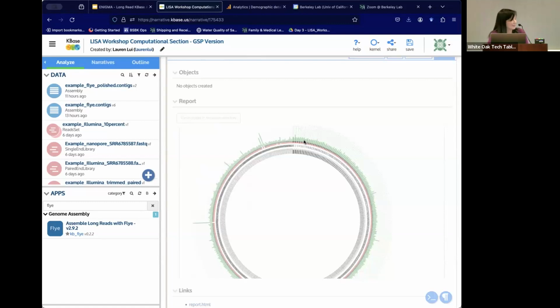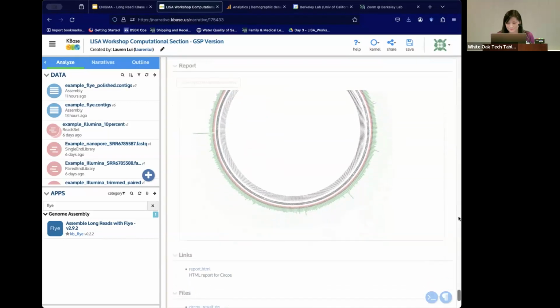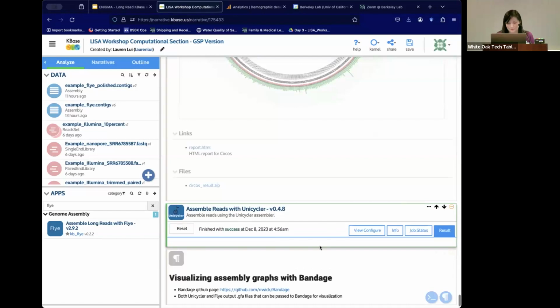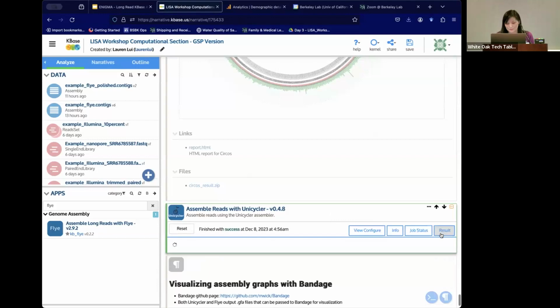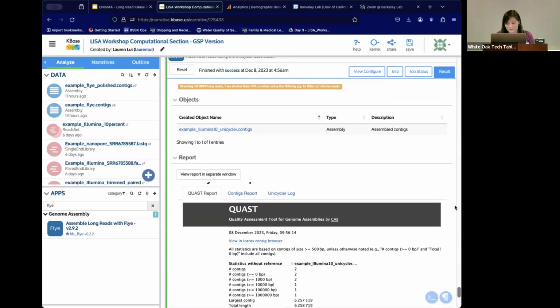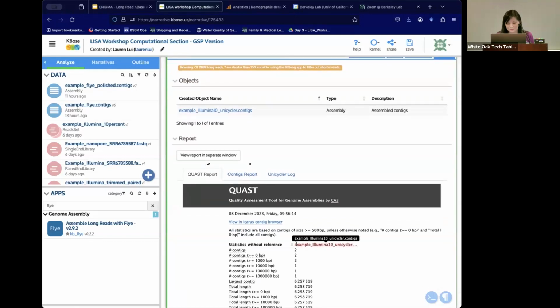It's just one thing to keep in mind as you're doing your sequencing. Even though the coverage really affects the assembly, if we did the hybrid assembly with the subsampled reads, the long reads add a little bit more coverage, and you could still get a pretty good assembly with less sequencing if you have the long reads added to it.